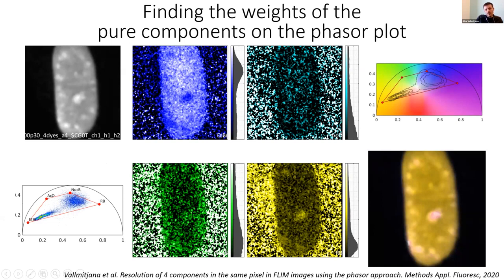In this case, this is the original intensity image, just one snapshot. You decompose, so unmix the 4 components in each pixel, and you see clearly there's a predominance of the ethidium bromide inside. There's this guy here, an accumulation of the rose bengal in this area here. And basically, we are unmixing pixel by pixel the exact proportion of the 4 components.